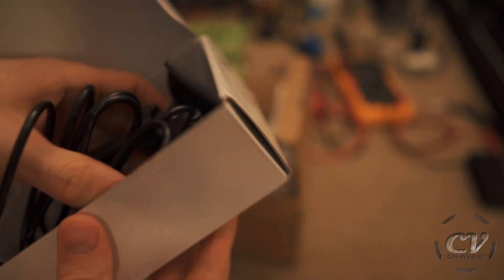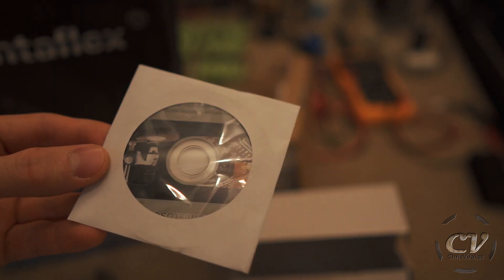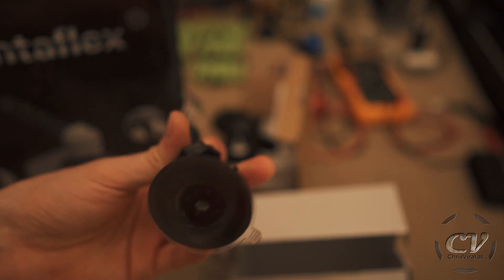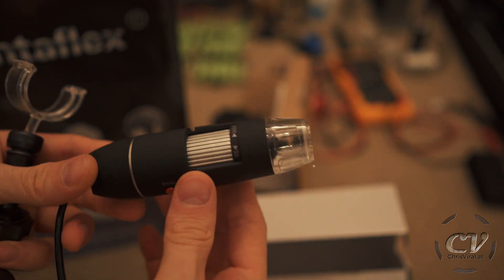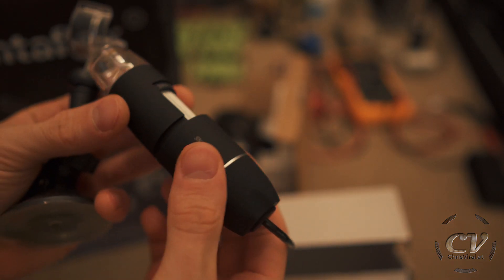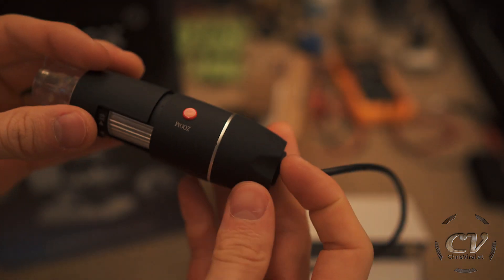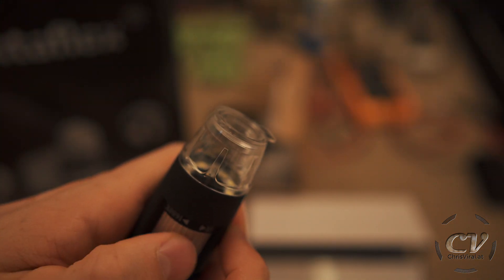So it's rather simple. It comes with a calibration ruler, a little CD — I hopefully won't need this — this stand with a suction cup thingy, and the actual unit itself. It's coated with smooth-touch plastic. I'm not a big fan of that, but as of now it's smooth to the touch and it's nice. I hope it will stay this way. This part is removable — snap and zoom — and you can also move this inner section. This is the camera itself. Wow, this will go all the way in there. That is crazy.